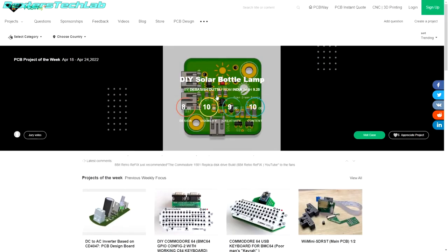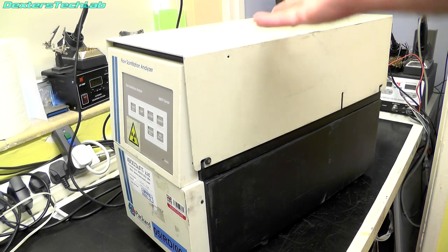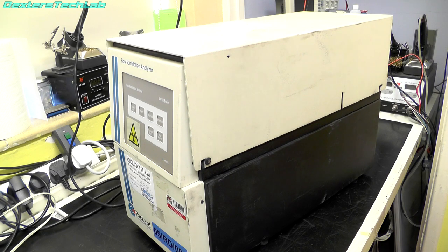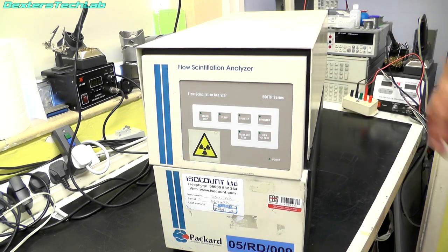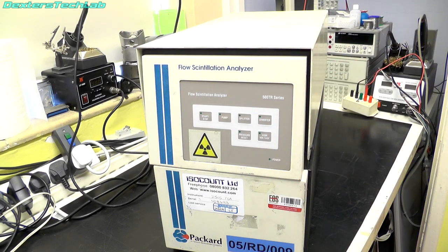I picked this up fairly recently — I saw it on eBay and noticed a few things inside that made me think it might be a good one to pick up, do a teardown on, and possibly recover some parts from. So this massive great big box is a Packard Flow Scintillation Analyzer, which detects radioactive fluids.